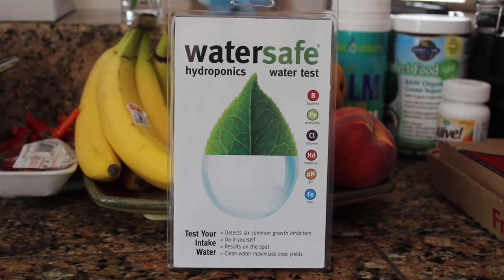This is a water safe hydroponic water test. This is something that is really useful — something I was looking for when I first got into hydroponics and couldn't find, which is why I use reverse osmosis water right now. But for those of you still using tap, a lot of municipalities have acceptable tap water for hydroponic use. Mine doesn't, but we're going to go ahead and test it.